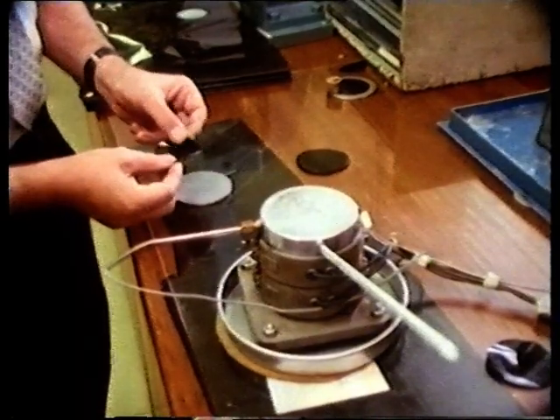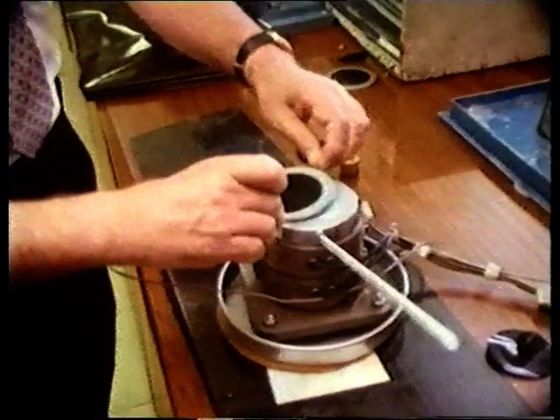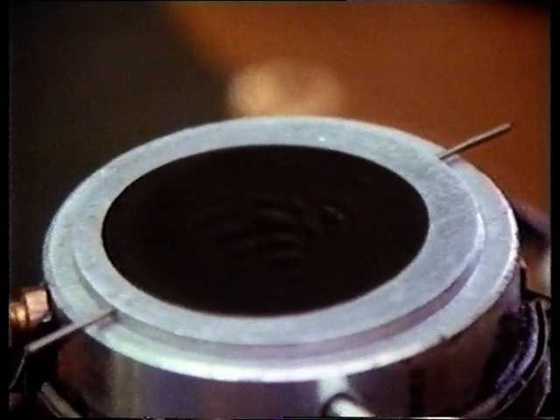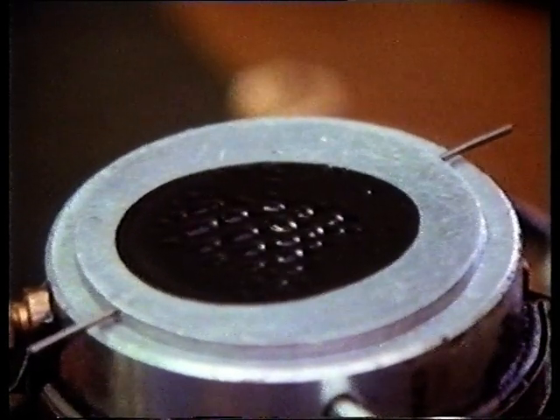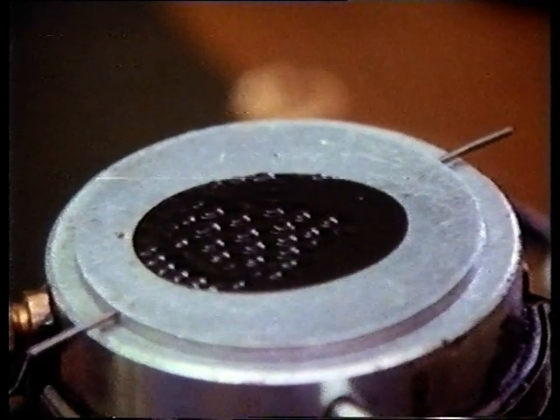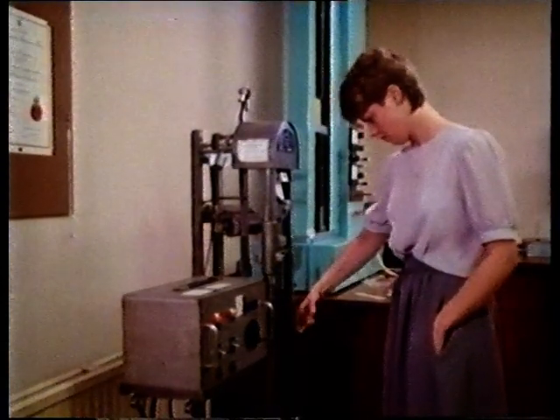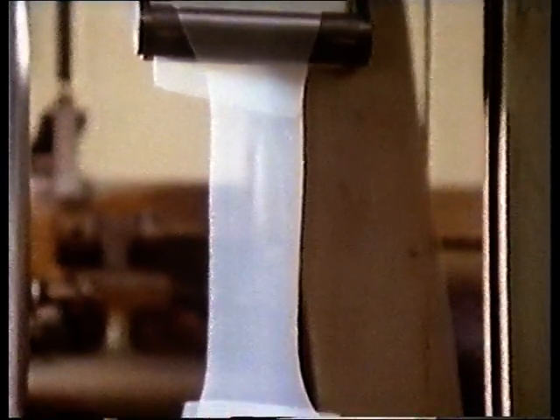A test is being carried out which shows how polyethene sheet, for example, has different properties in different directions because of the way in which the carbon chains are pulled into certain patterns when the sheet is produced. If a disc of the sheet is heated, it shrinks more in one direction than the other. This means that it behaves differently when it's pulled, say, in two different directions at right angles. Here, in one direction, it forms a narrow neck which stretches and stretches and stretches as the tension is increased.